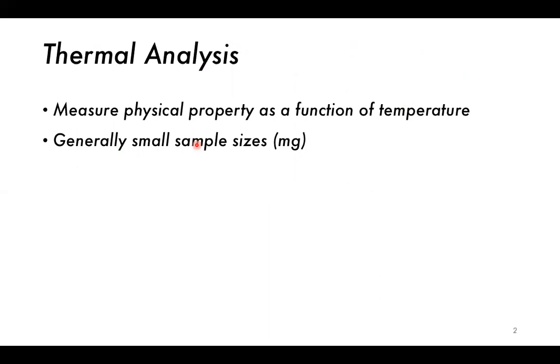For certain techniques, such as thermogravimetric analysis, or TGA for short, you don't get any back at all, because it continuously heats it up until there's nothing left but a sticky black residue, the carbon that remains, or the inorganic salts, or whatever it happens to be in your sample.